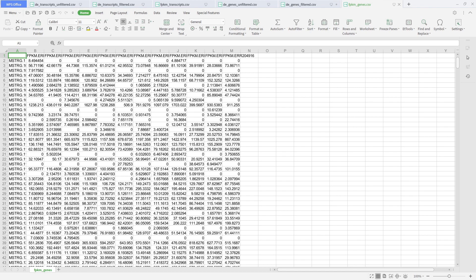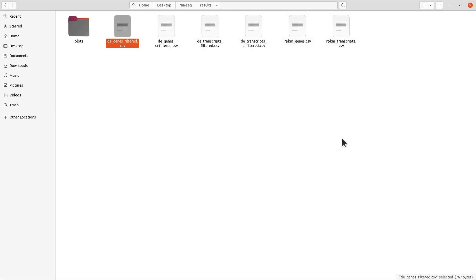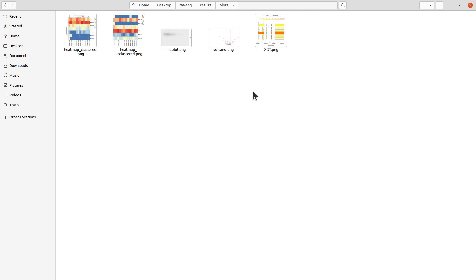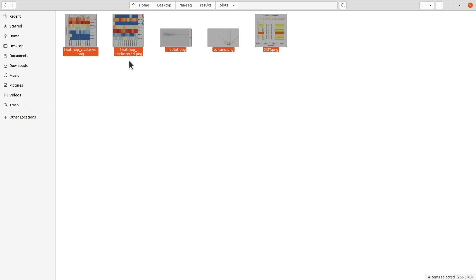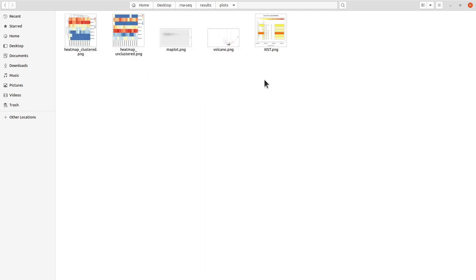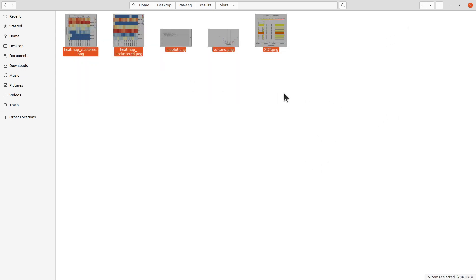The plots are also here in this directory called 'plots.' We have about five files here — five figures — so you should have the same. Let's go back and I will explain these plots in detail.